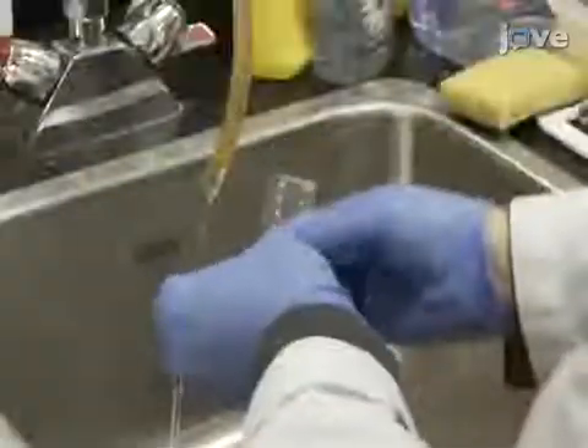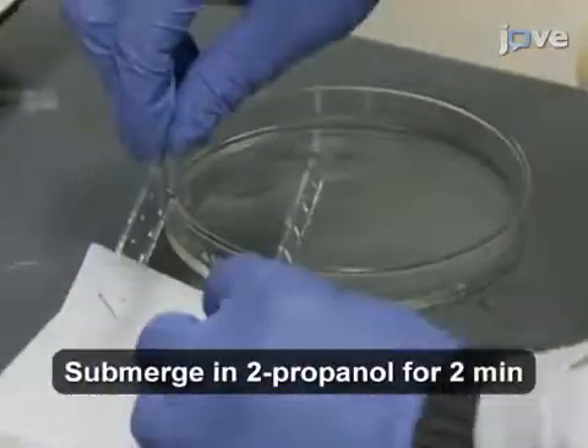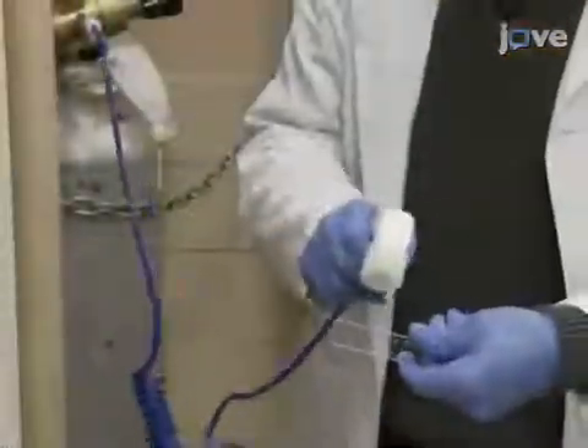Then, clean the device surfaces with laboratory soap and water and dry with compressed air. After submerging the device layers in 2-propanol for 2 minutes, dry them with compressed air.